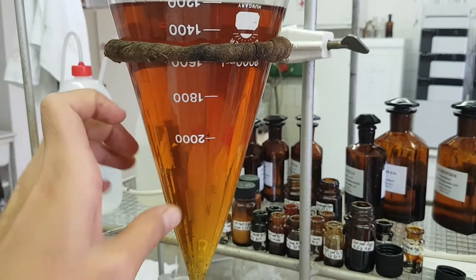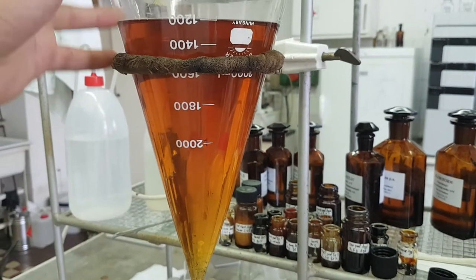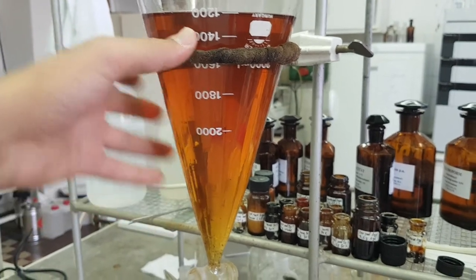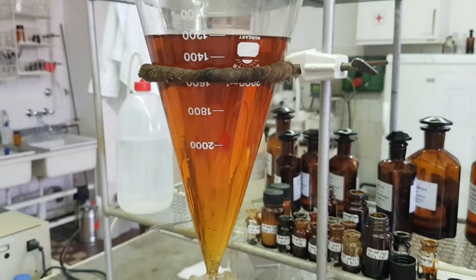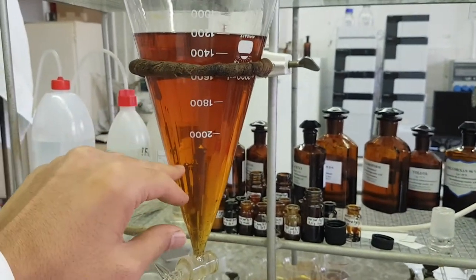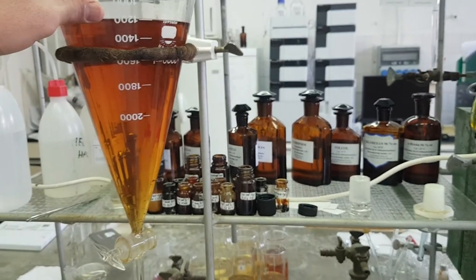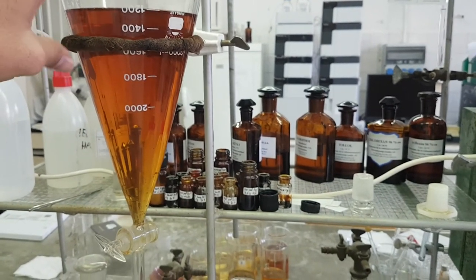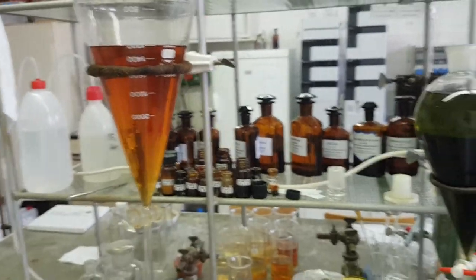But once I shook the separatory funnel, I could no longer distinguish between them. There are a lot of tips you need to keep in mind in order to operate correctly. You need to have them at hand and learn from the experience of others.